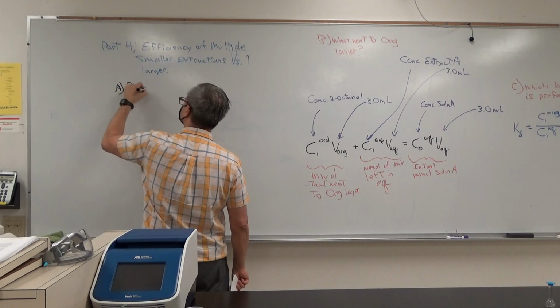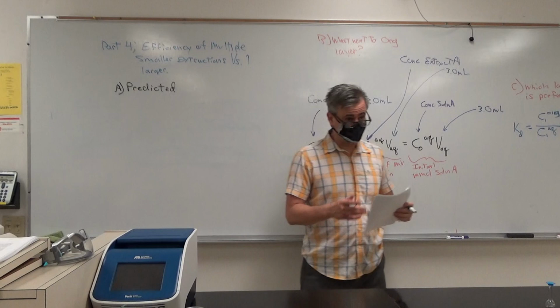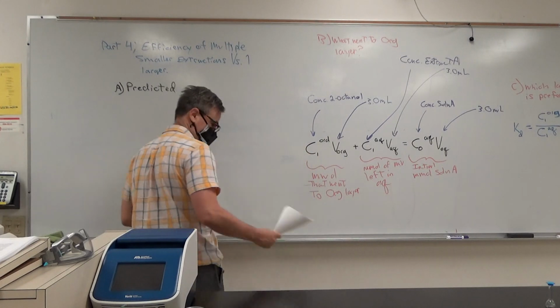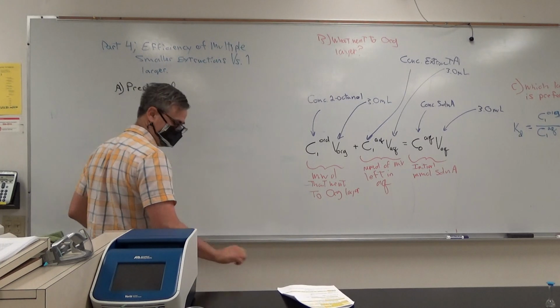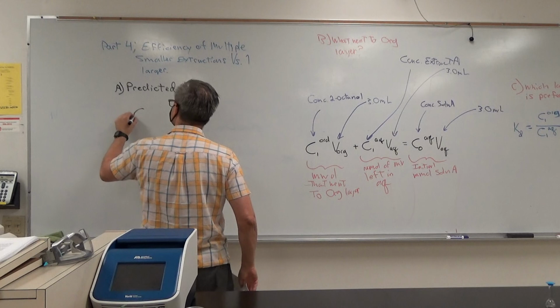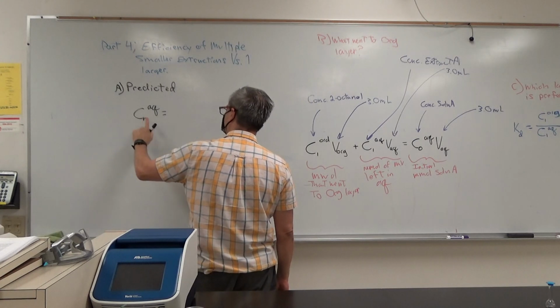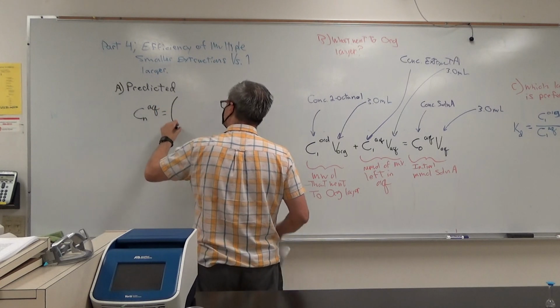Predicted. You already did the one larger extraction. That was part 3. Now we're going to think about doing multiple small ones. So C sub n left in the aqueous is the concentration left in the aqueous layer after n extractions.